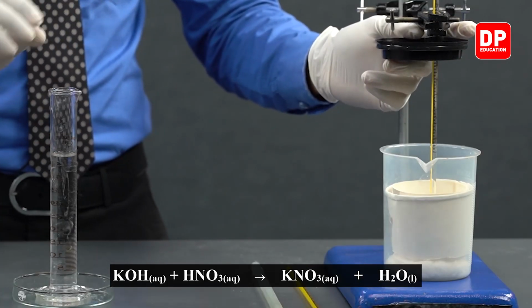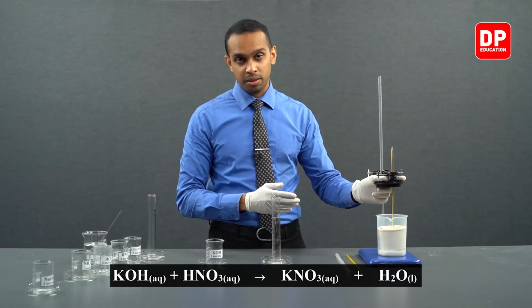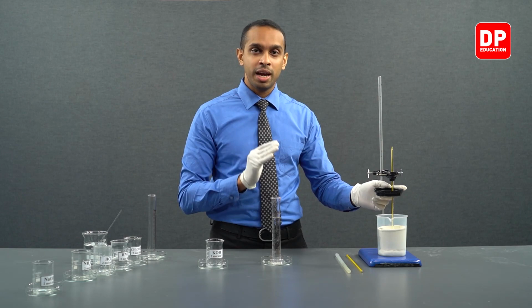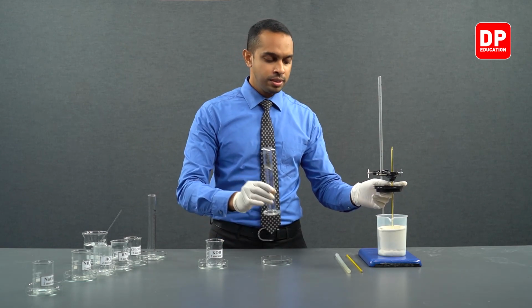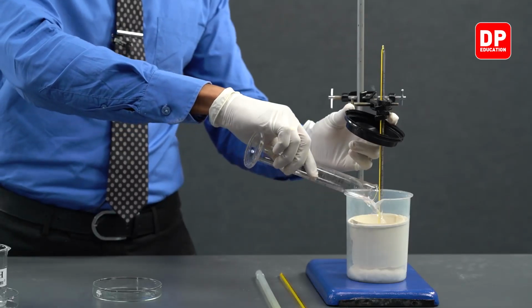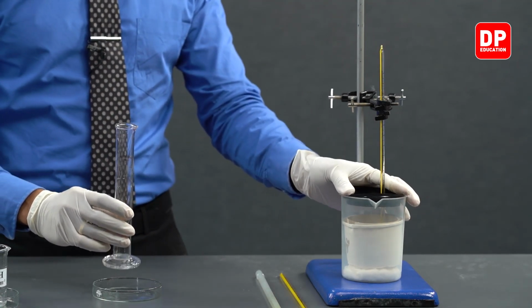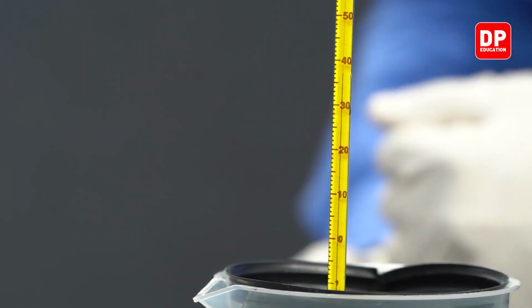As soon as we add our potassium hydroxide solution into our nitric acid solution, we are going to record the highest temperature that this reaction mixture is going to reach. We have our potassium hydroxide. Now we are adding it to our nitric acid solution and we are going to measure the highest temperature that this reaction mixture is going to reach.